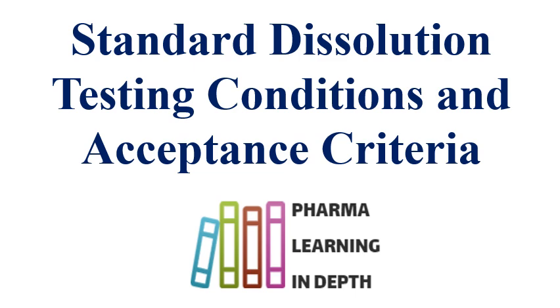So this video is regarding the dissolution conditions which are standard and which are mild in nature, so that the dissolution will be a meaningful test, will have biorelevance, and will also be related to the in vivo behavior of the formulation. If dissolution conditions are not standard, that means they may be stressful to the formulation, then the release profile will not be proper.